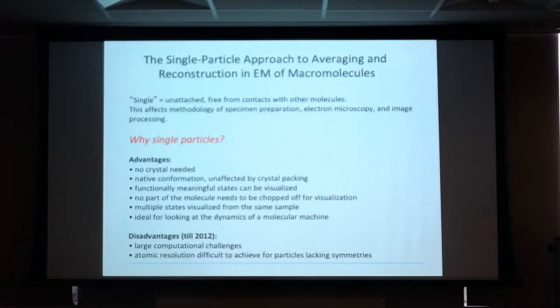Now, what I don't say here is, remember, we talked about DeRosier and Klug, helical reconstruction. Well, they developed programs just to deal with helically arranged molecules. They were useless for anything else, okay? So there used to be programs that were tailored to the geometry and the symmetry of molecular arrangements. Okay, so here the single particle approach means that we don't make any assumptions. We have simply a reconstruction scheme that fits all.